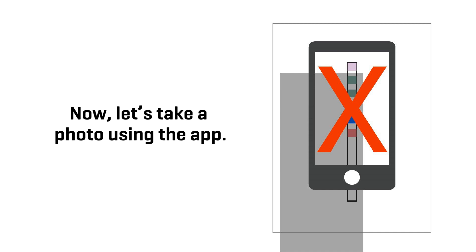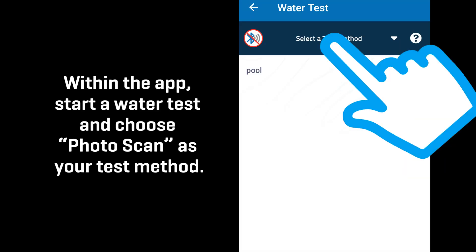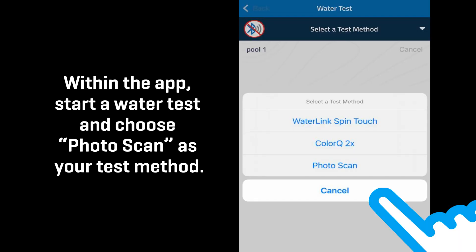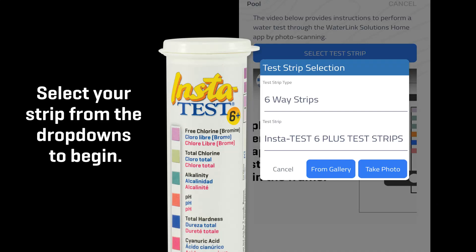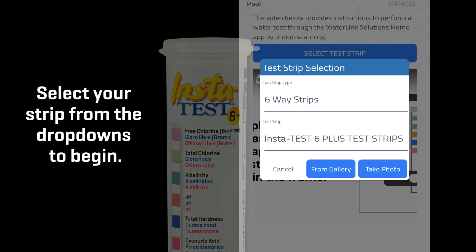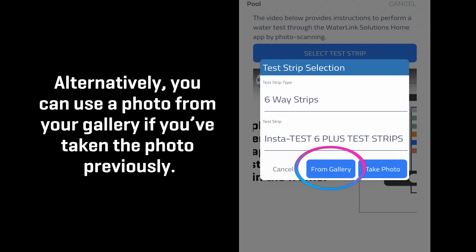Now let's take a photo using the app. Within the app, start a water test and choose Photoscan as your test method. Select your strip from the drop-downs to begin. Choose to take a photograph. Alternatively, you can use a photo from your gallery if you've taken the photo previously.